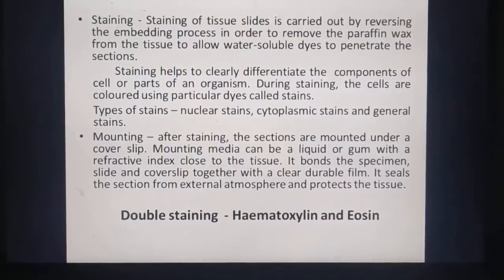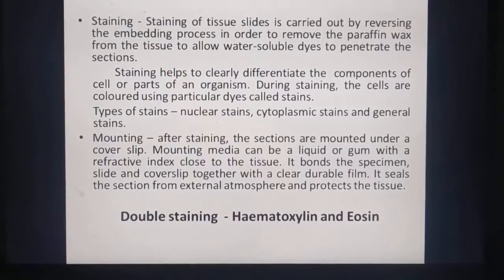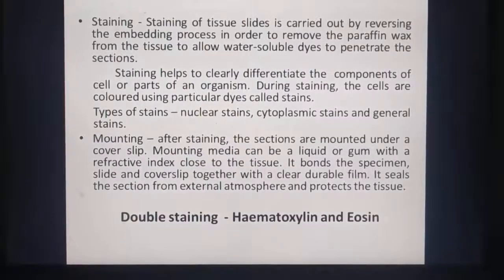The staining technique that we are using today is called double staining, where two stains, one nuclear and one cytoplasmic stain, are used.